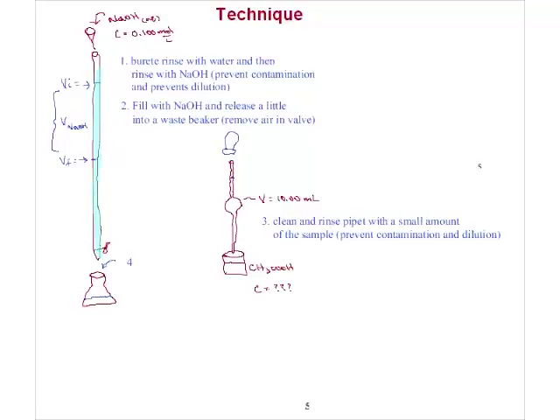There we go. We know that when we start pipetting and when we measure things with glassware, we look at the bottom of the meniscus. So when we make a measurement, we always make sure the bottom of the curved surface of the water is touching the line on the glassware, and you make sure the bottom of the meniscus just touches that line.